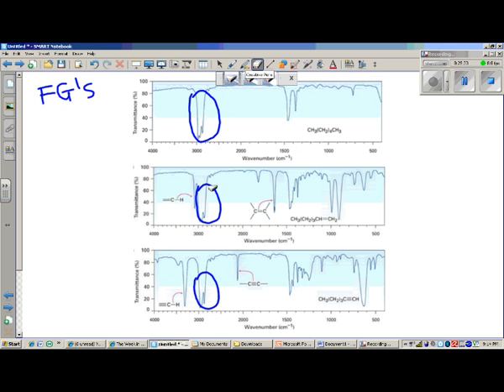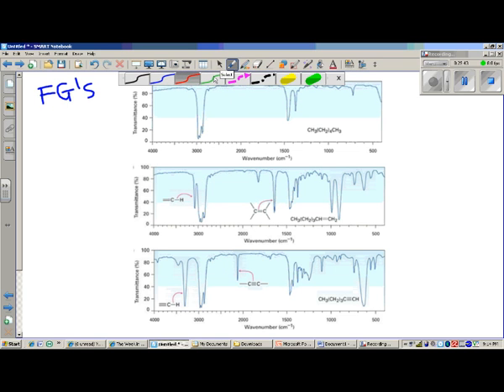But there are differences. All right. Just take a look at what we have to the left of each of those groups. In hexane, there is nothing to the left of the CH groups, but in hexene, there is a sharp peak here that clearly isn't present in hexane.